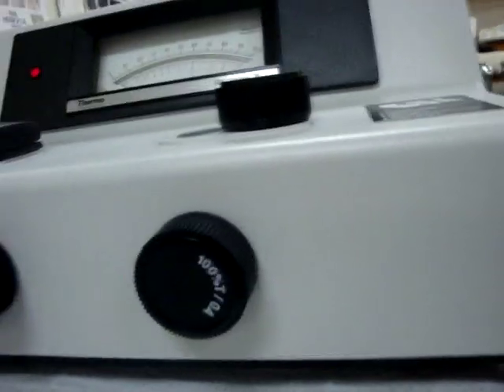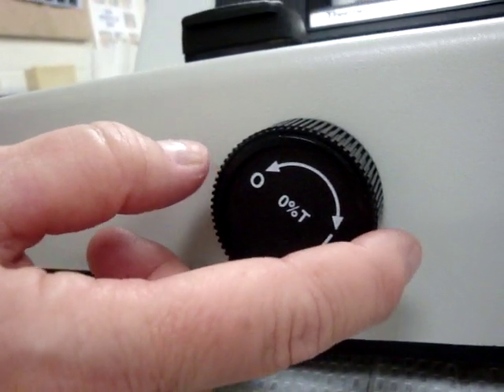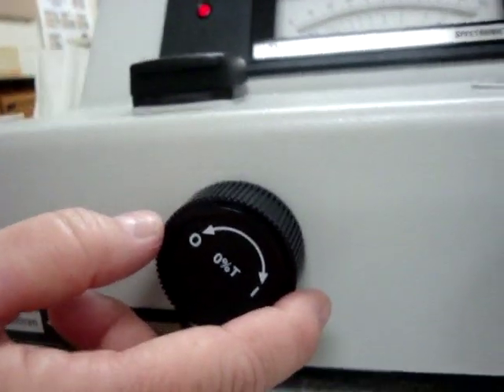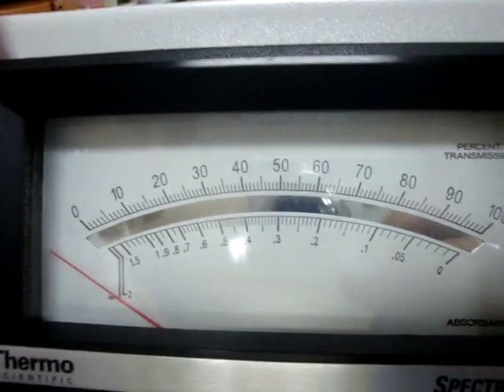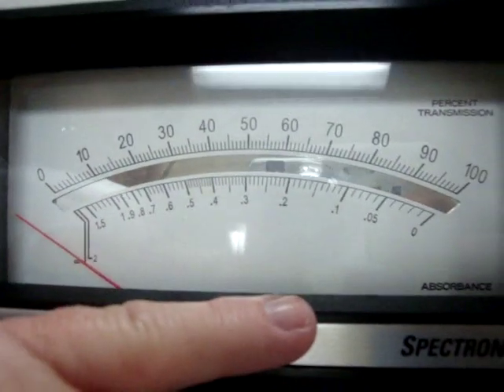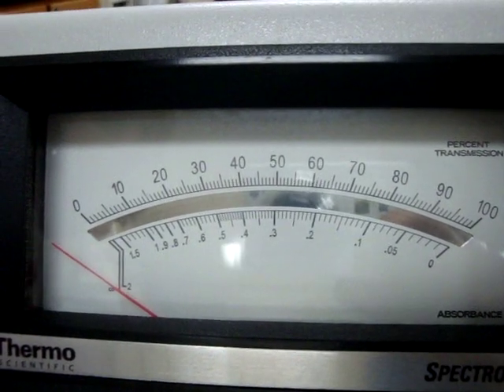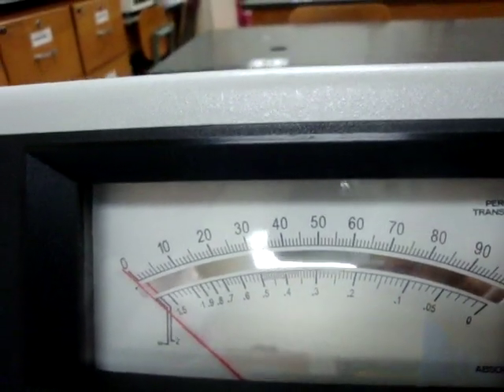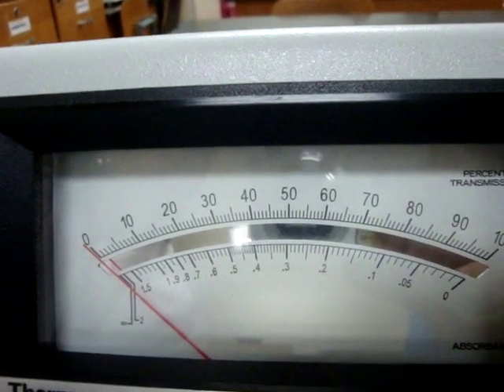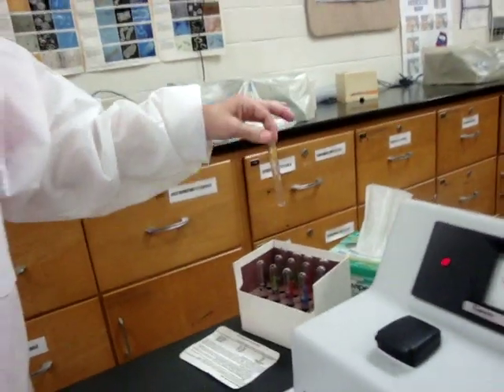The next step is to set the zero percent transmission using the knob labeled 'zero percent transmission.' The goal is to set it at zero percent transmission. Note that on this machine, percent transmission is on the top scale and absorbance is on the bottom — this is opposite from the other machine. Turn the knob until the pointer comes to zero.